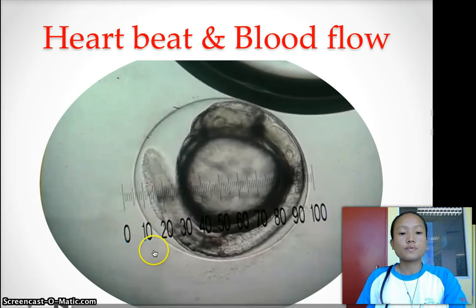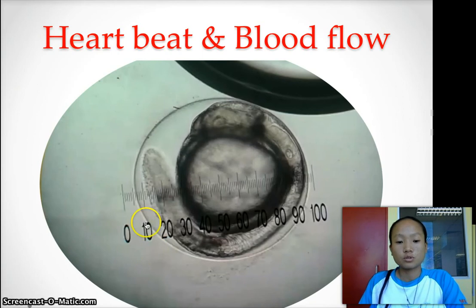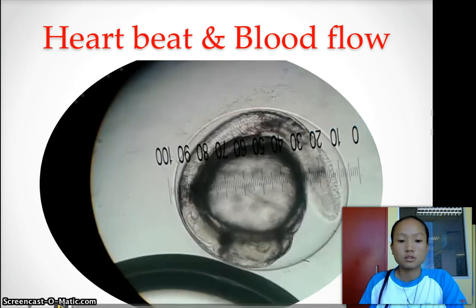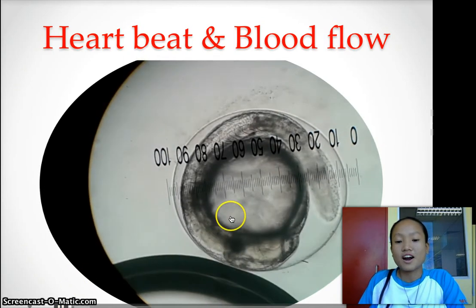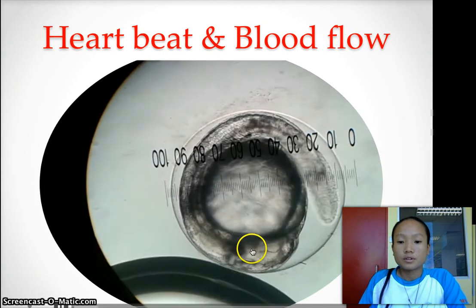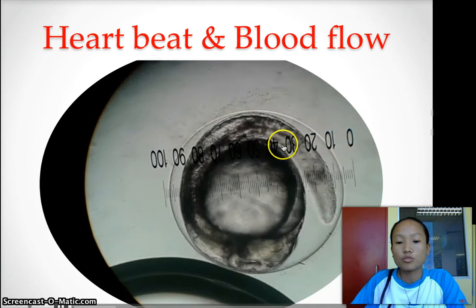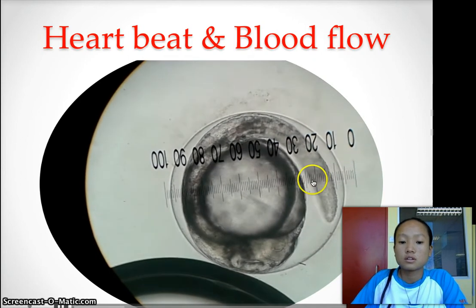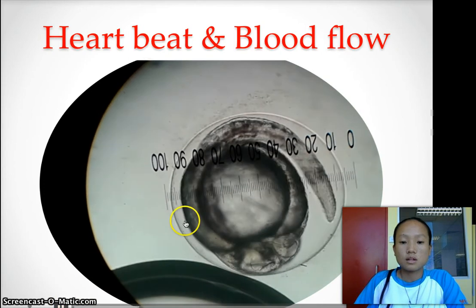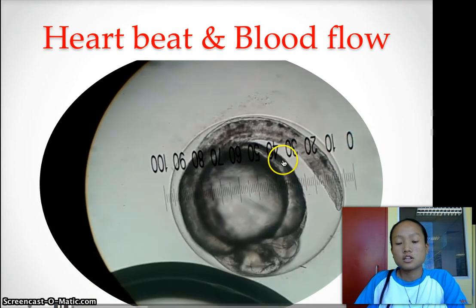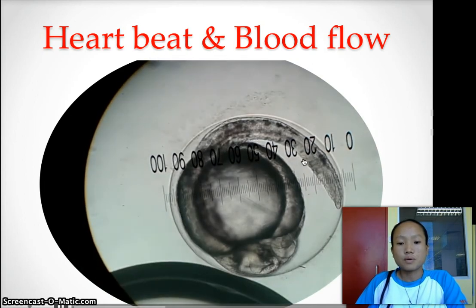This video shows the heartbeat as well as the blood flow for the control. Here you can see the heartbeat of the fish embryo, and here you can see blood flow from the heart all over the body. This also shows the intensive spasm that Jian mentioned, which may trigger the premature hatching of the fish embryo.